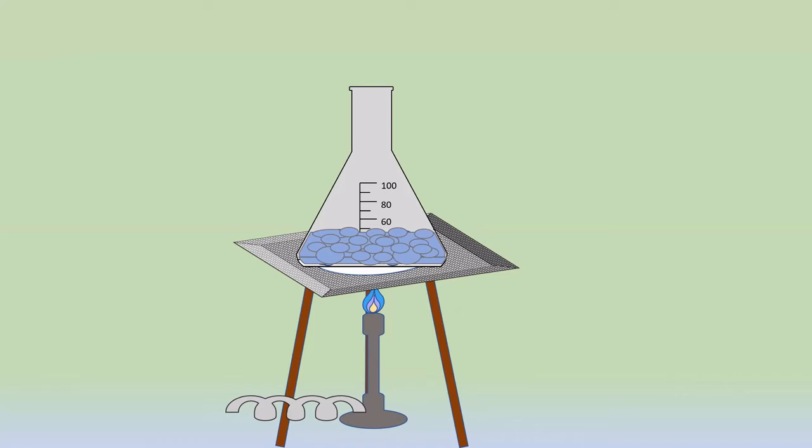It is expected that in the volume we have taken so far, the solid should dissolve. So continue heating for 15 to 20 minutes. You will find that the solid, the salt which was formed, will get dissolved in water. Okay, so till now our step number 1 is complete. We have done the alkaline hydrolysis of ester.